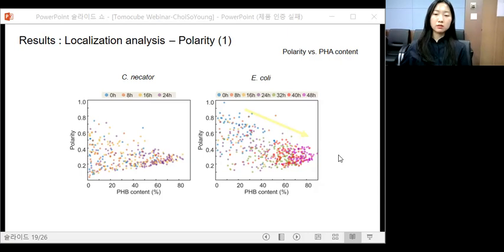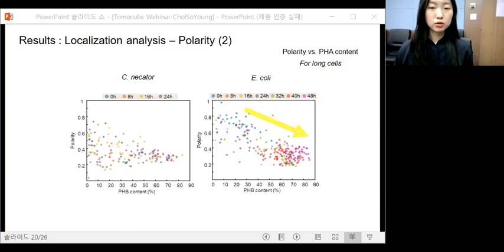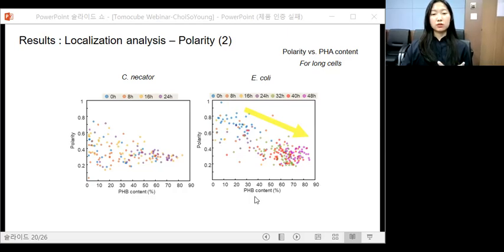Interestingly, the polarity for E. coli cells seems to be negatively correlated with the PHA contents, while the C. necator does not show any noticeable correlations. The correlation is more clear in these new scatter plots. These were made to contain only the cells which are longer than the average length of dividing cells. Because the polarity indicates the distance of PHA granule to the cell pole concerning the cell length, so we assumed that the longer cell shows the polarity differences more clearly. In the case of E. coli, the negative correlation is more clearly observed, while the plot for C. necator cell still does not show any correlations. The decreasing polarity trends indicate that the PHA granule tend to be localized to the cell poles, even though they can be formed anywhere in cell cytoplasm.